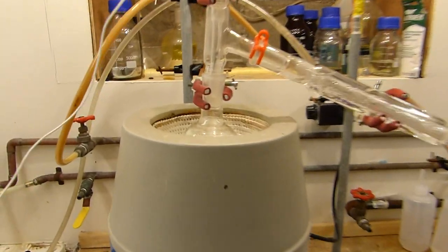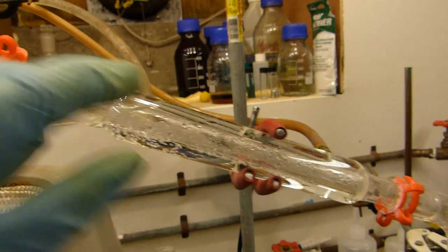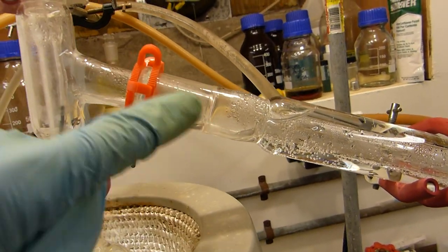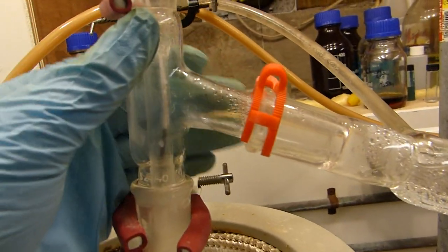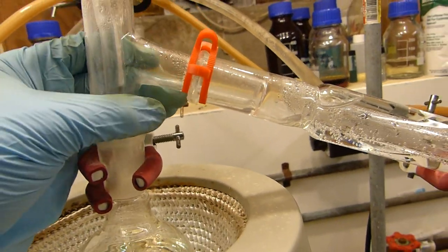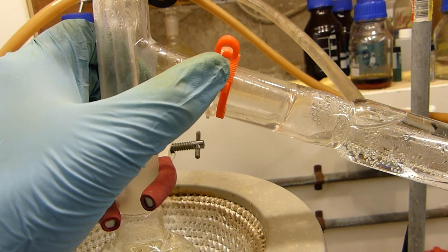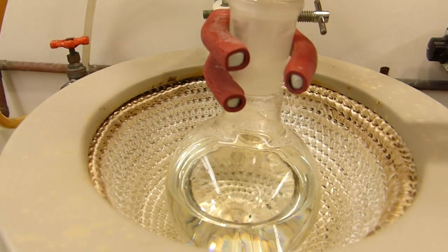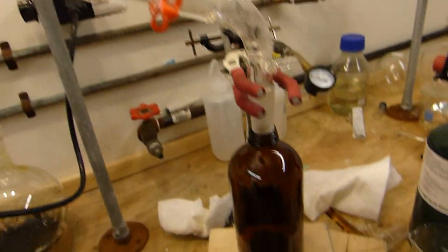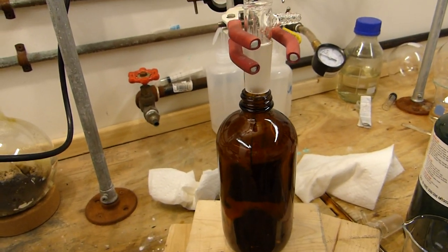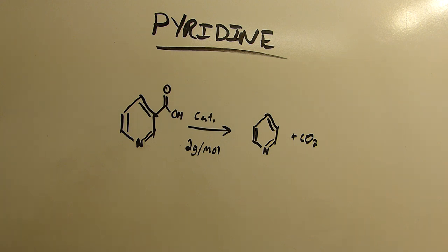So I set up for simple distillation and I've got the crude pyridine product here in the flask. It looks to be close to the theoretical amount so I'm pretty happy with that. To increase the yield I've actually not bothered to clean out this condenser apparatus. I left this as set up for the decarboxylation and that's so we could recover these little bits of pyridine that are left in here. Now some nicotinic acid does come over at the beginning of the reaction and throughout the reaction in fact, but you can see here that even though this stuff has cooled to room temperature no additional nicotinic acid is precipitated out of the pyridine. So it can be reasonably concluded that there are milligram amounts at best of the nicotinic acid left in this pyridine. So waste not want not, there's going to be milligram amounts left in the distilled pyridine anyway because we're distilling it from a solution with nicotinic acid. So it's pretty wasteful and sort of not useful to have taken this apart and cleaned it. Anyway I've got a weighed bottle here and I'm going to obviously cover the yield from that, so that's pre-weighed and we'll just get the heat going and we'll strip this over.